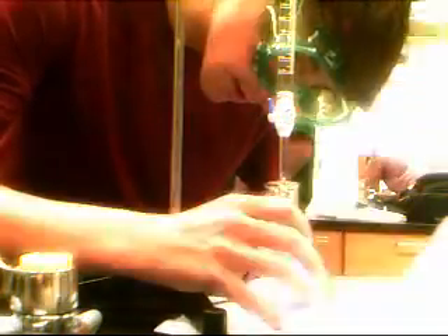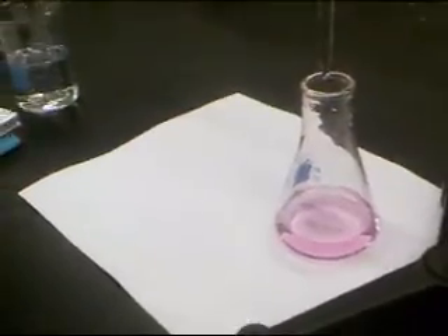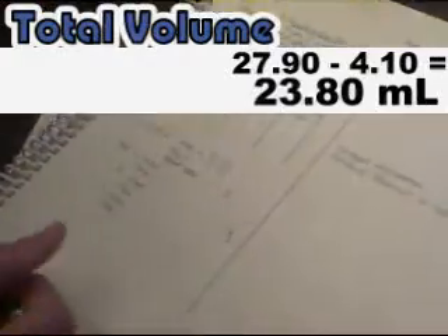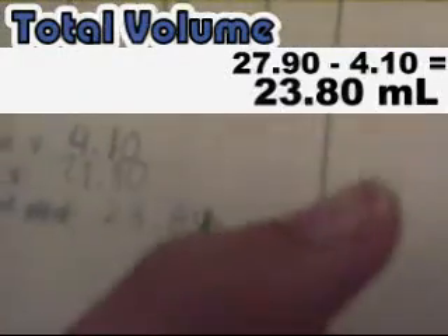To calculate the total volume used in the titration, subtract the initial volume from the final volume and record. Because this is a sloppy titration, this is a rough estimate of how much titrant will actually be used. In this case, the volume is about 23.8 mL.